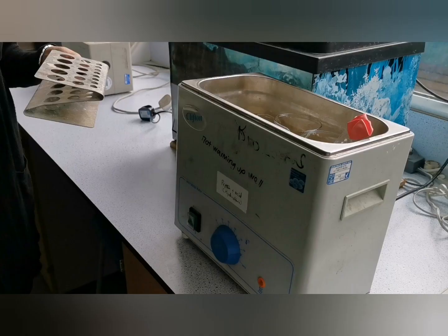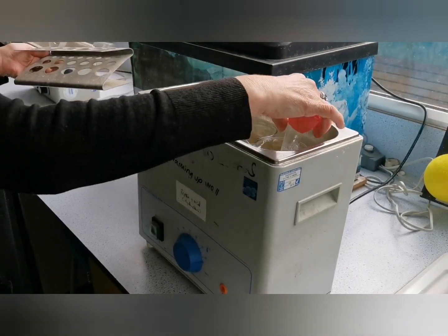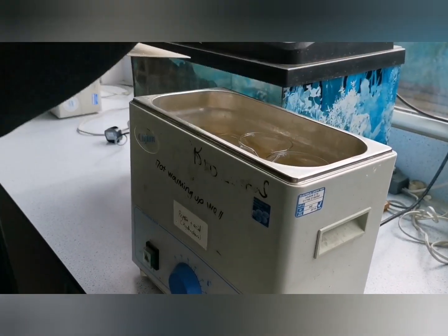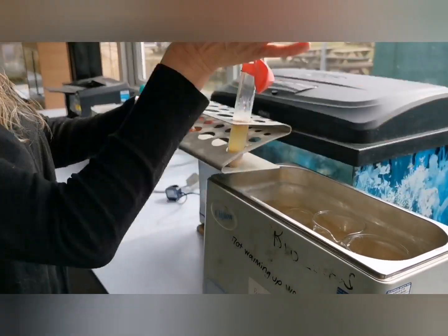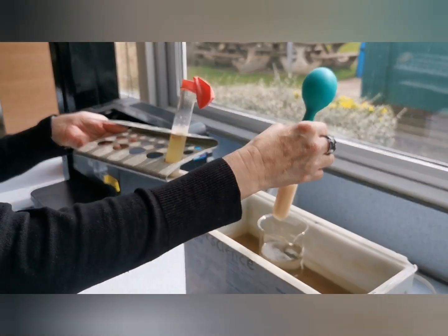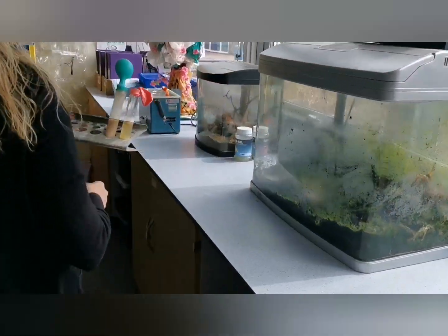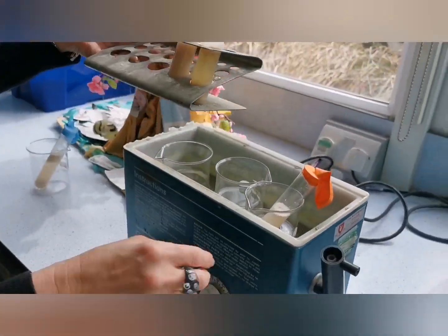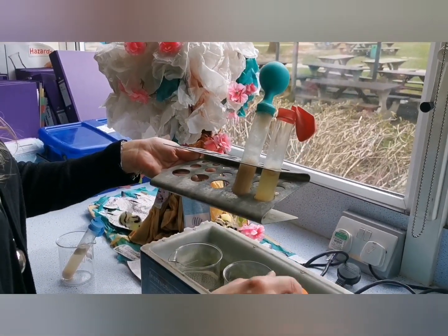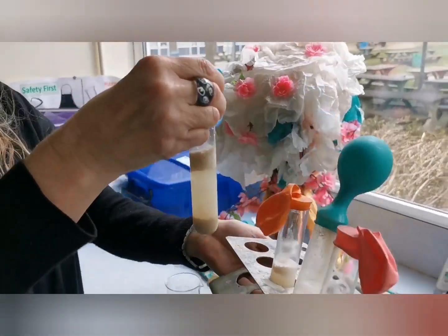3 hours later. So here we are, this is now about 3 hours later. So this is our hottest, this is our 90 degrees. As you can see, not much going on here. So let's put that in there and we'll be able to compare them all together. This is our 40 degrees. Definitely some gas has been produced there. Here we have our 20 degrees, so quite cool this one. Again, tiny bit, but not much going on there. And then finally, we have our fridge version.